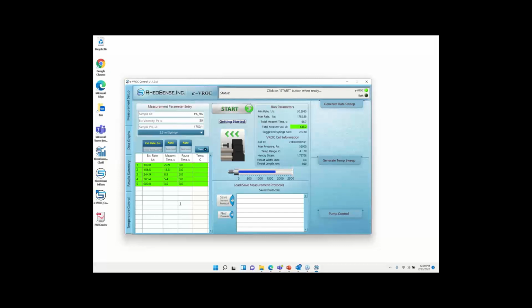And again, with the extensional chip, we recommend, if necessary, getting a bit creative, and that would be soaking times and temperatures. If you know something degrades your samples, like I explained with the guar gum earlier, those degrade under acidic conditions when you warm them up. So think about how you want to clean out your samples, and really consider doing some soaking and maybe elevated temperatures, so long as you're not, say, denaturing protein or making something insoluble by heating it. So I think with that, we'll just pause and see if there are any additional questions, and then we'll wrap it up.